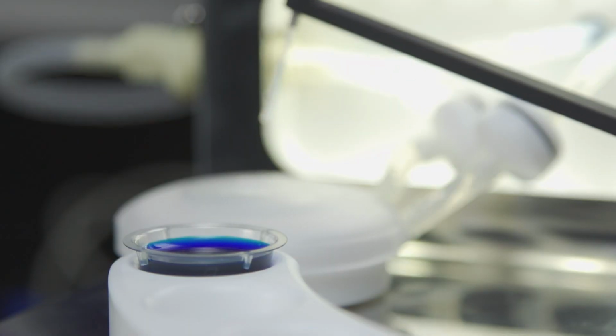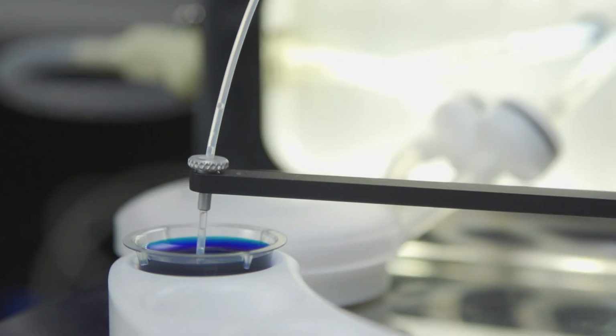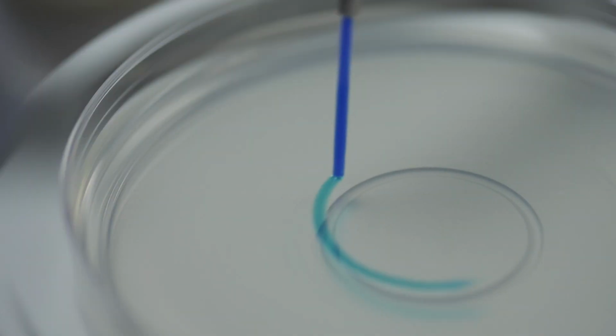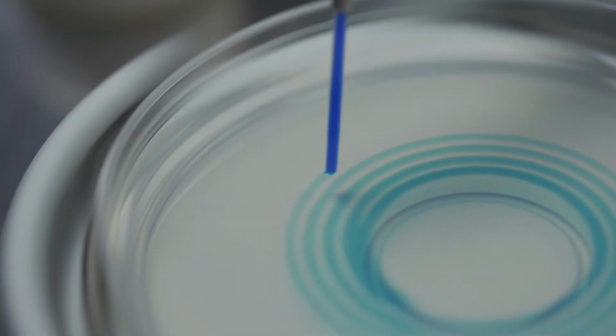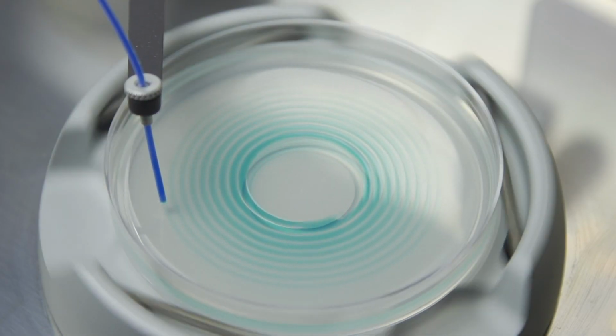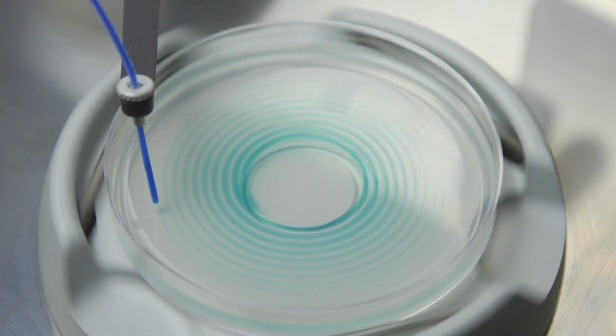The stylus draws 50 microliters of sample water and spreads it exponentially on the R2A agar plate. As the plate spins, the stylus disperses less water the further it moves from the center. The center of the plate is now highly concentrated, while the outer edge has a lesser concentration of sample. If there are bacteria present after incubation, there will be fewer colonies along the outer edge of the plate. This helps our automatic reader to count colonies in a split second.